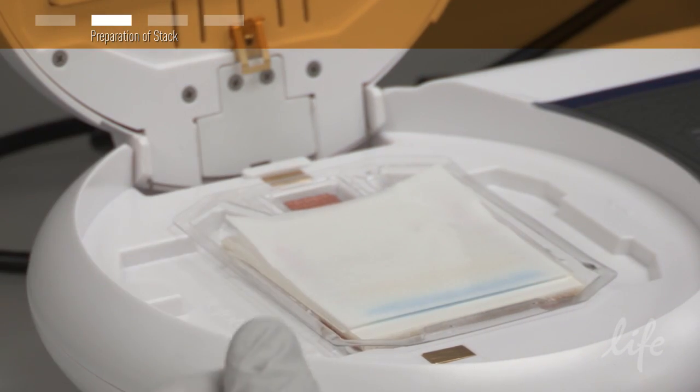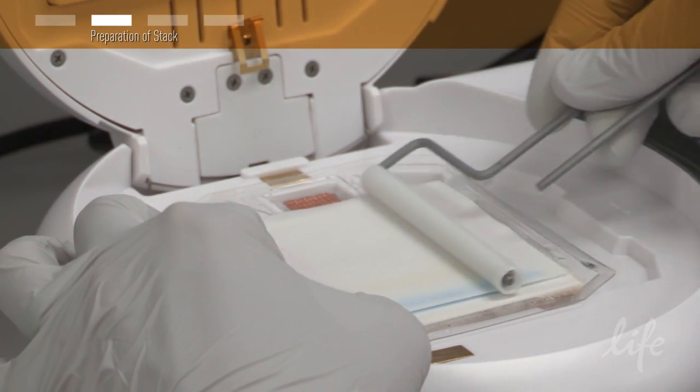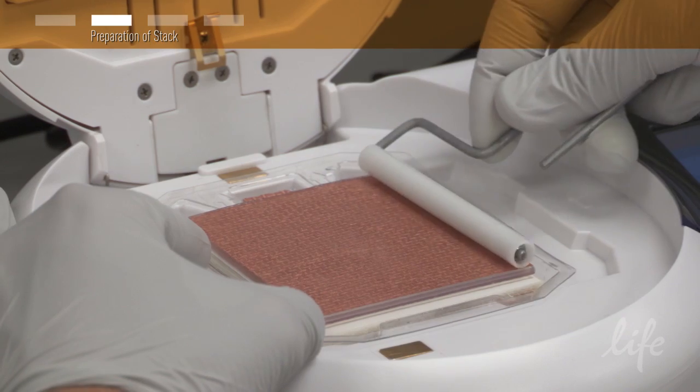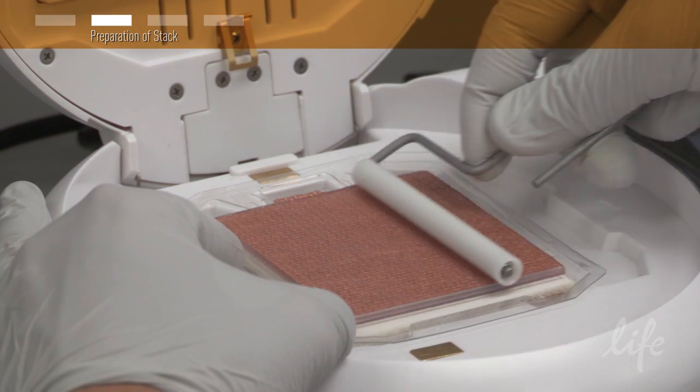Then, remove air bubbles using the roller. Place the top stack over the pre-soaked filter paper and again, remove air bubbles using the roller.